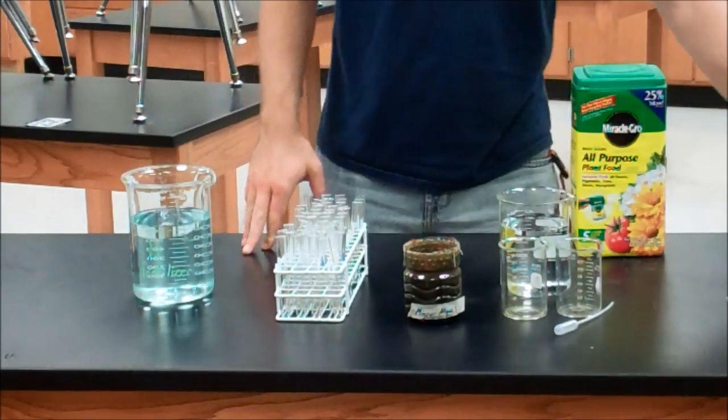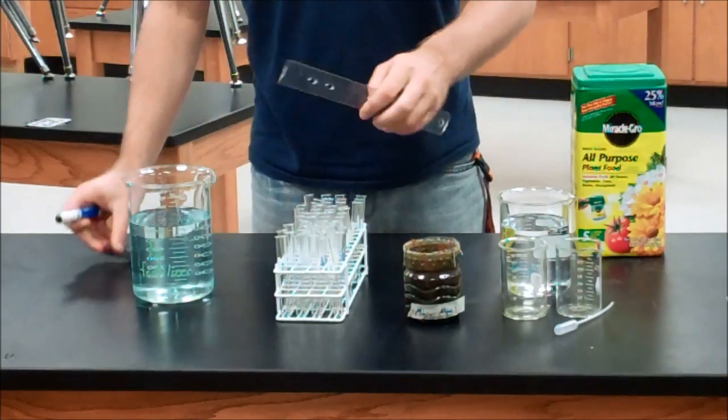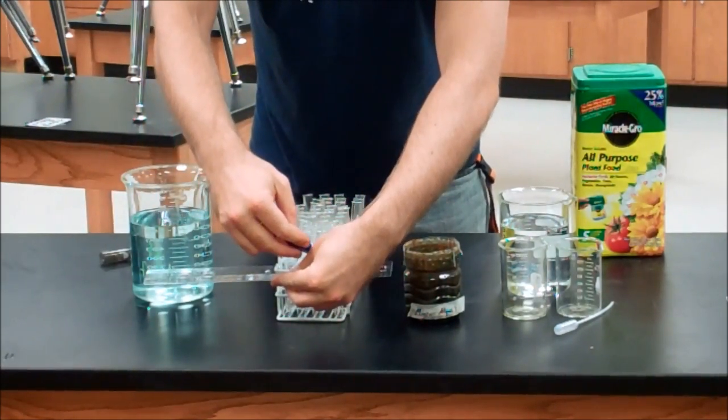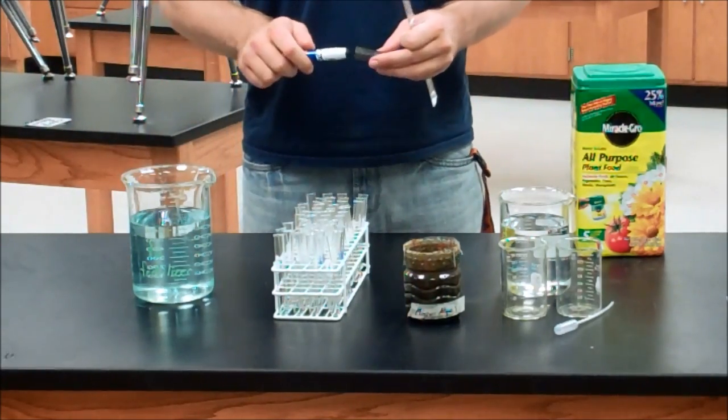Next you'll need some test tubes. On your test tubes you're going to want to mark some consistent volume. However you want to go about doing that consistent volume, make sure that they're all going to be about the same.